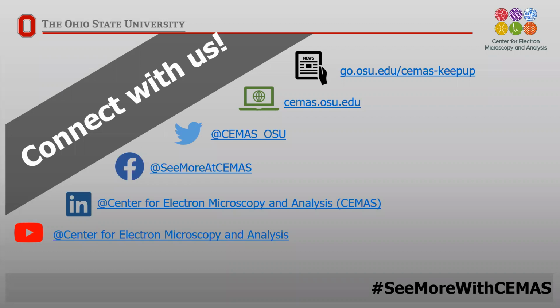Okay, and next question. What is normally the database you use for lattice parameters and space groups? For lattice parameters, the most common database is the ICDD database, which is used for X-ray diffraction. So you're doing similar kinds of experiments to X-ray diffraction. So you can use that to get your d-spacings and your planar spacings. There is also the ICSD, the Inorganic Crystal Structure Database, which actually has the crystal structure in it. And you can use that to actually calculate patterns and use that to measure your d-spacings and actually calculate single crystal diffraction patterns from that, match that up against your unknown.